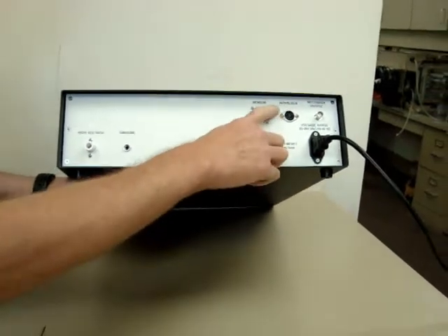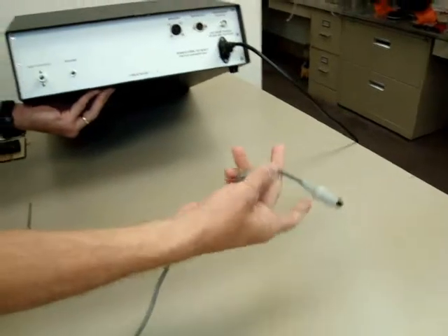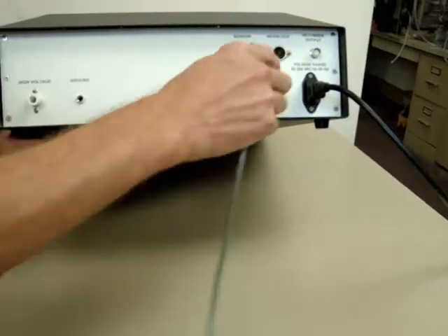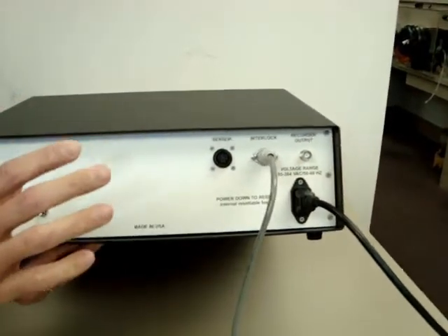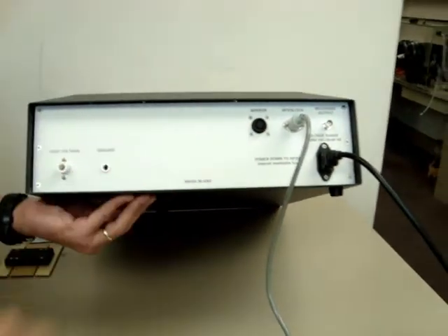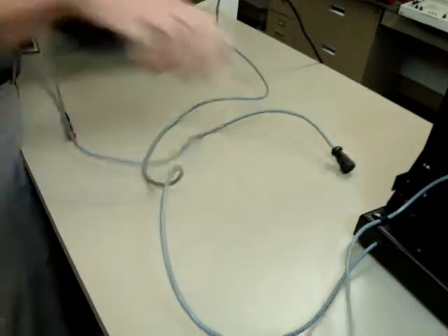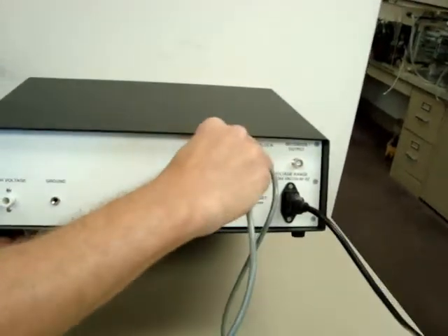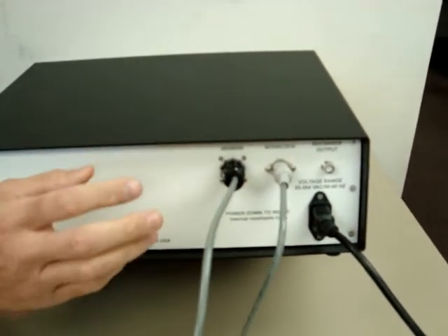Next, we're going to plug in the interlock cable, which comes from the cage bottom. This cable is notched at the top, and the notch is in the 12 o'clock position, so make sure it sits in there nice and easy. Next, we plug in the sensor connector, which comes from the sensor cable. This too is keyed — make sure it's keyed in correctly, then turn it so the cable goes in and seats in very nicely.